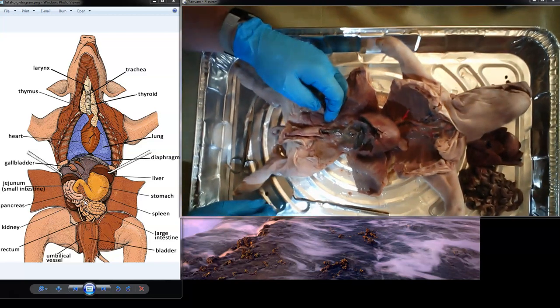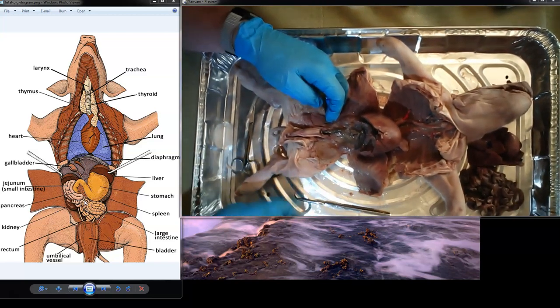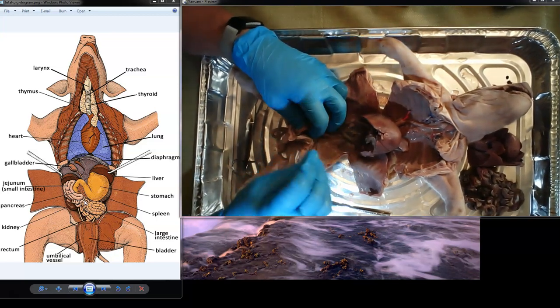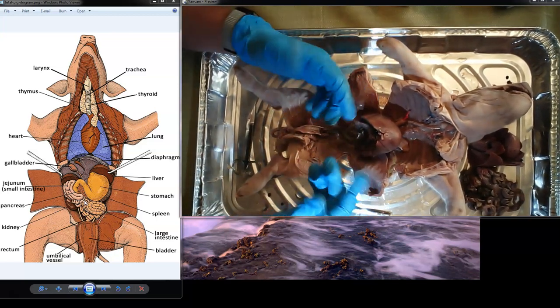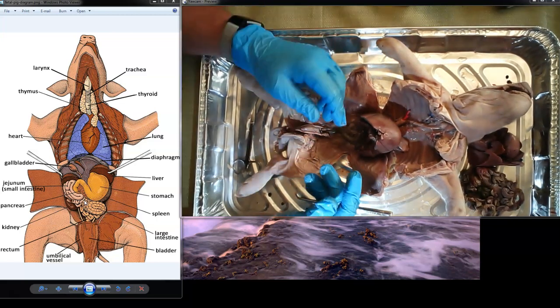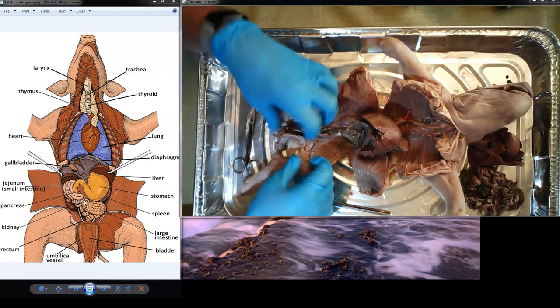I'm gonna leave this off to the side. That's stuff that was inside the liquid inside the mother that the pig, when it opens and closes its mouth, goes in. It doesn't really eat it. It doesn't use it as food, but it does go into the stomach. So it's kind of like food, but it's not.